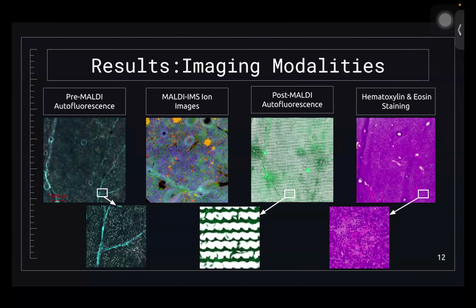So we then confirm the size of the ablation, or the size of the laser shot, and to make sure it's what we set. So we don't have overlapping of the shots, which would mean we'd have overlapping of the data we collected. So like collecting multiple data, right? And then we have the H&E staining, which helps us visualize structures such as the islets a bit clearer.